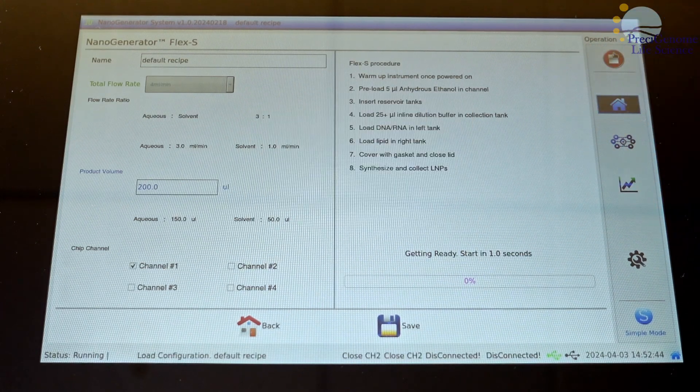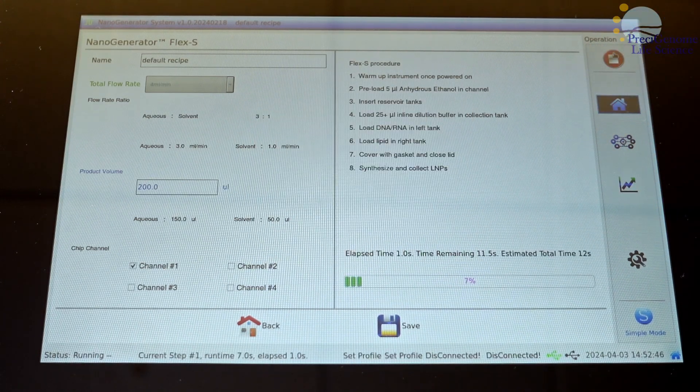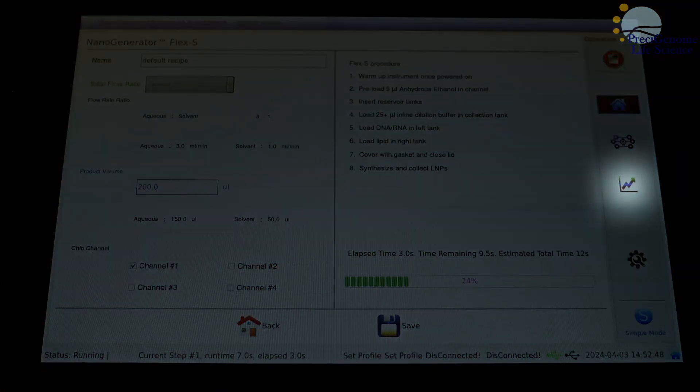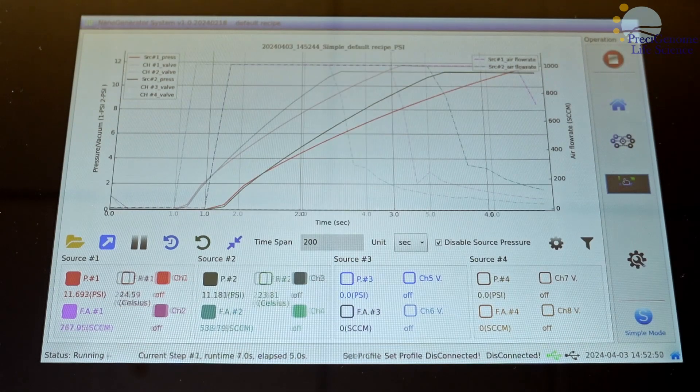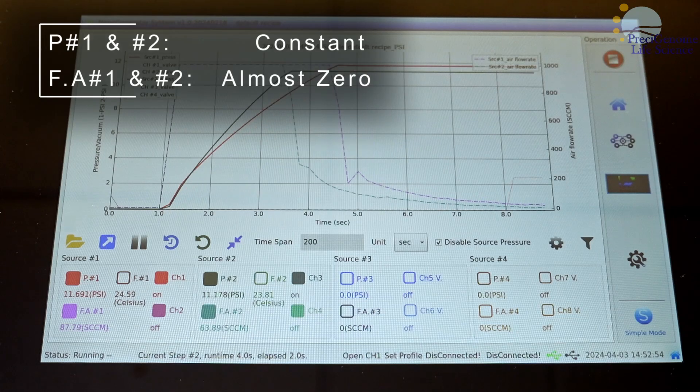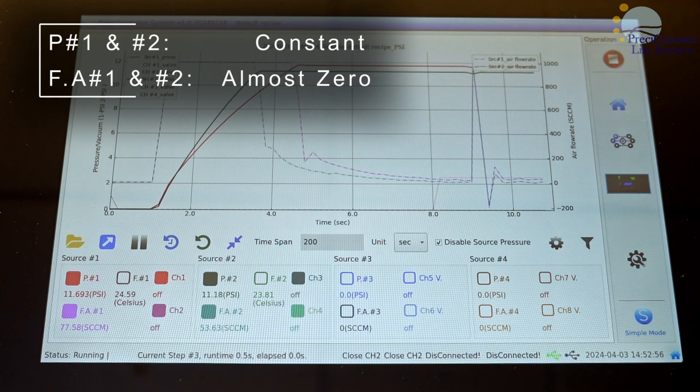After executing a recipe, you may monitor its live pressure and flow rates here. If your setup proceeded correctly, the pressure should quickly stabilize and the airflow rate should stay near zero.